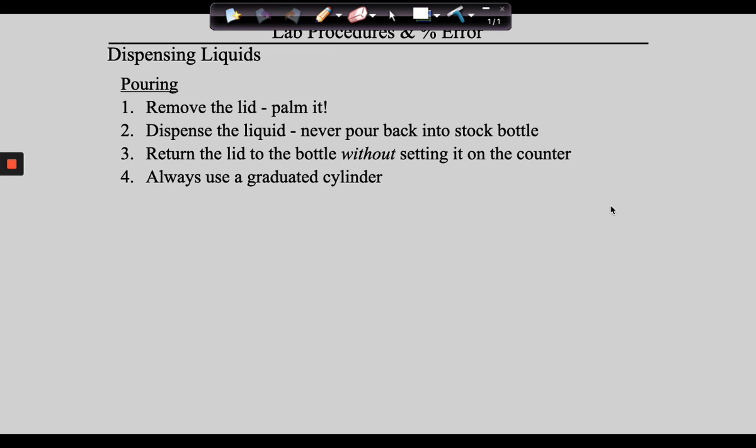Do you see the problem? Exactly. You don't know which lid goes with which bottle. Of course, this isn't going to be a problem for you guys because I don't clean up after you. So you're going to understand that you're going to keep things neat as you go. But guys, regardless, we have a problem. Understand in the university setting, if you screw this up, they will immediately fine you the cost of whatever's in the bottles. So guys, how do we avoid the problem?